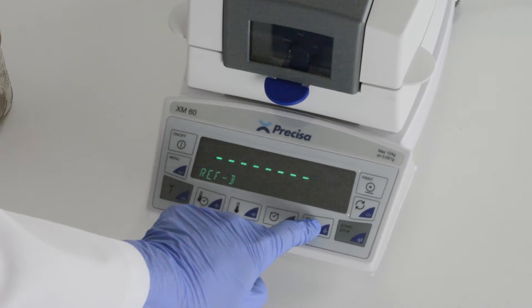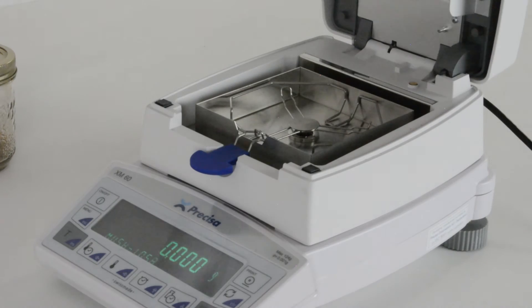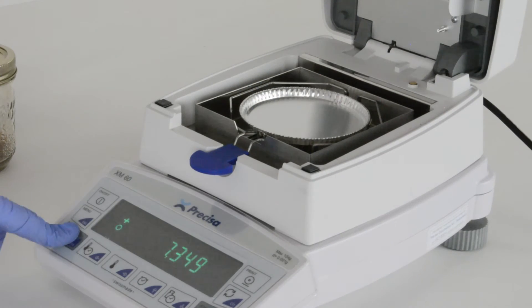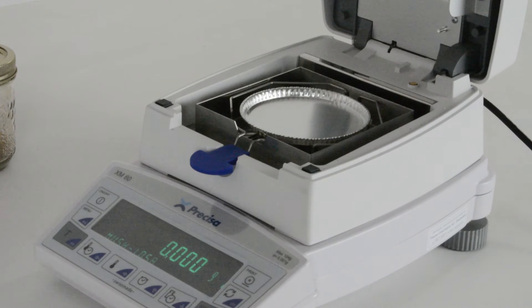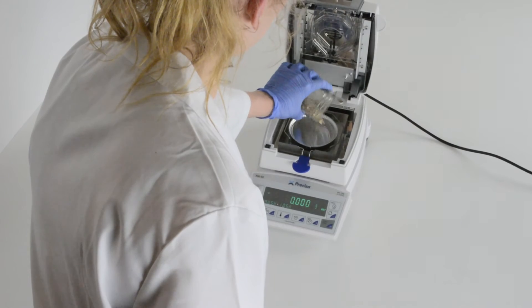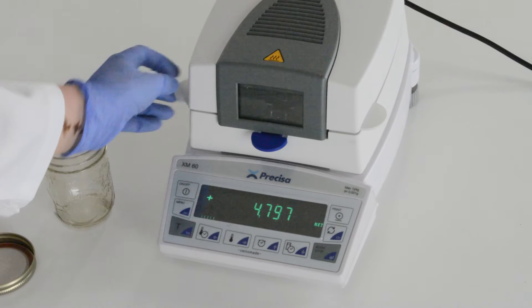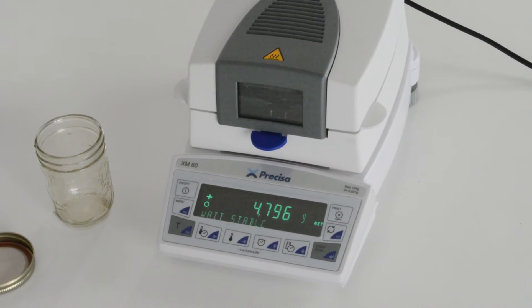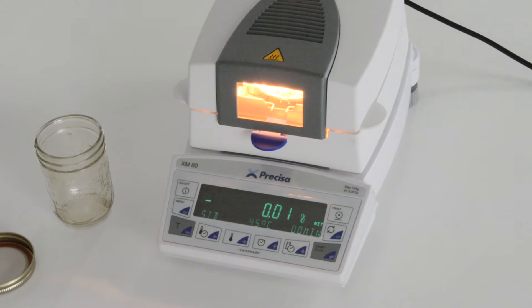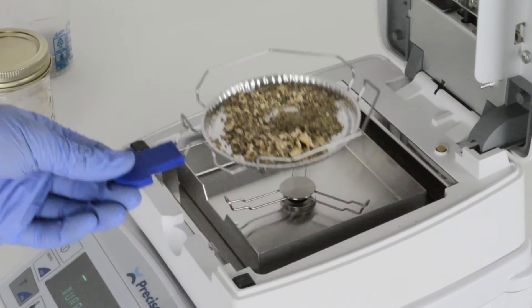First, select the method you want to run. Place your pan on the tray and tare. Add your sample to the pan until you reach your desired weight. Close the balance and press start. The indicator will display percent moisture loss and the run time. Once the process completes, you will see your results displayed on the screen and the results will print out automatically. Remove your sample and you're ready to repeat the process as many times as necessary.